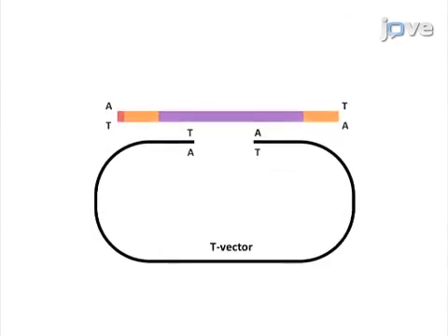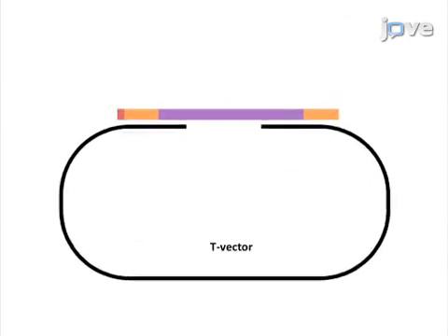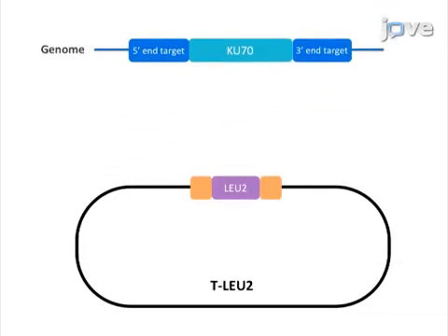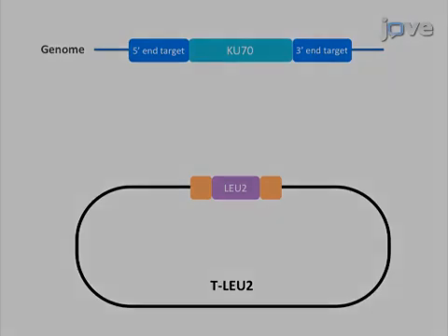After purifying the loxP-promoter-LEU2-terminator-loxP cassette, 3' A overhangs are added to the purified PCR product. The A-tailed PCR product is then ligated into a TA cloning vector to yield the plasmid TLEU2.